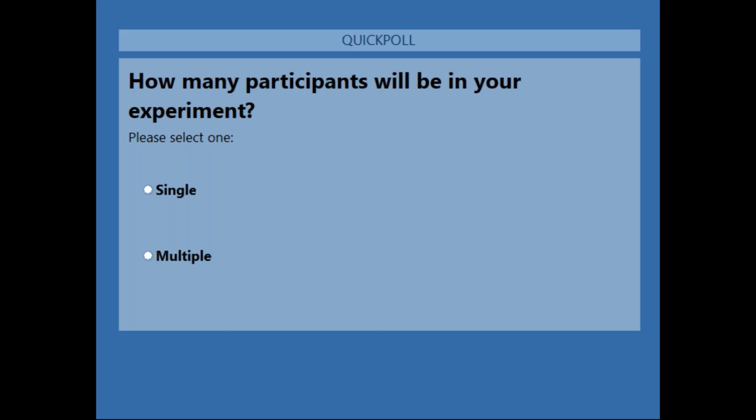Yeah, that's a great question and something I can cover. There's a couple of options for doing that. There's a very elegant event marking system within AcqKnowledge. So in real time, you can pick out certain behaviors, yawning, coughing, standing, sitting, marking whatever type of behavior is relevant. And then the system will provide you with all kinds of information concerning the time that that occurred. You can mark the duration as well.